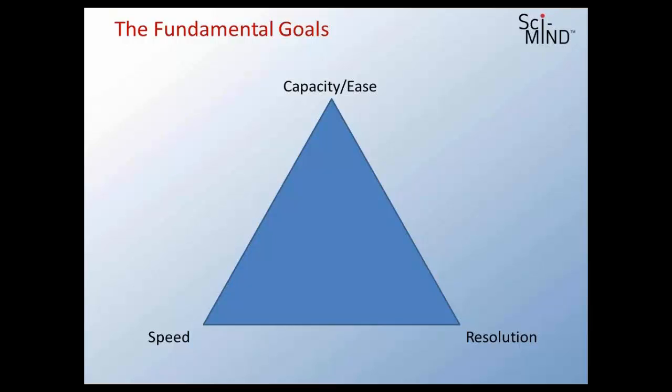Well, I like to think about those, and this is not a new way of thinking, but it is a useful one, I think, as the three corners of a triangle. And what I'm going to tell you, as somebody who's been doing this for 25 years, is that pretty readily I can give you two of those. So think about this, and we'll think about this with some chromatograms a little later in the session.